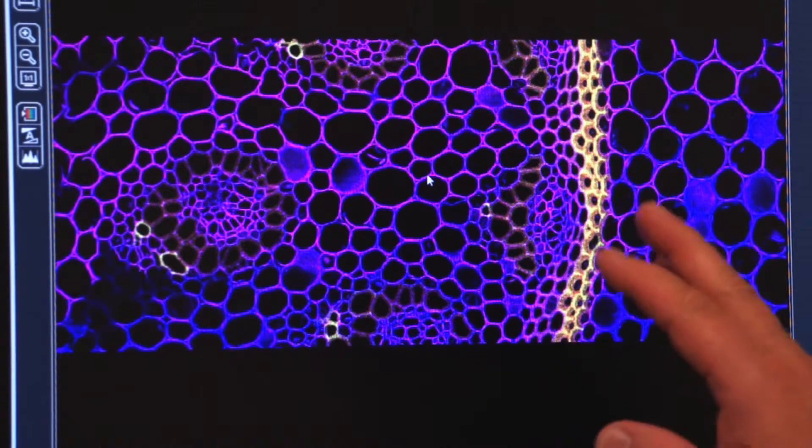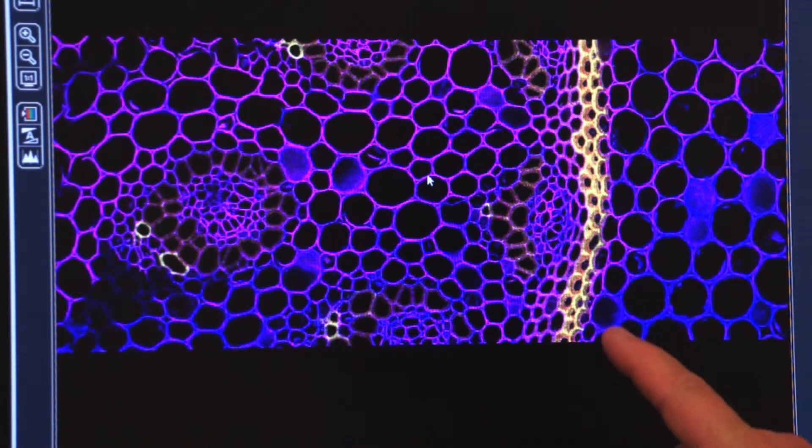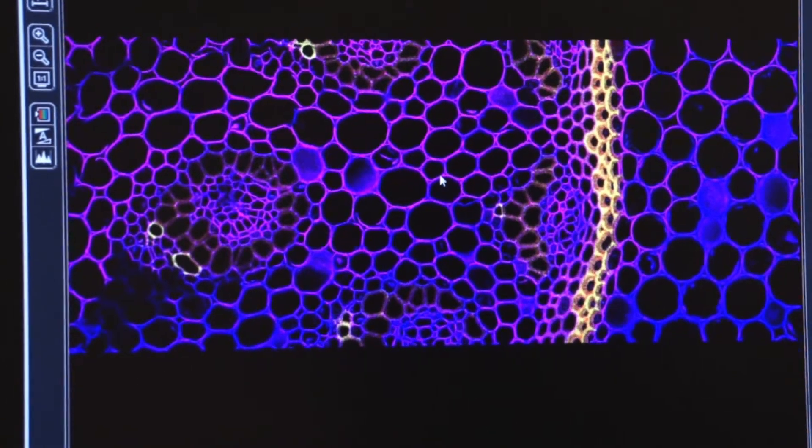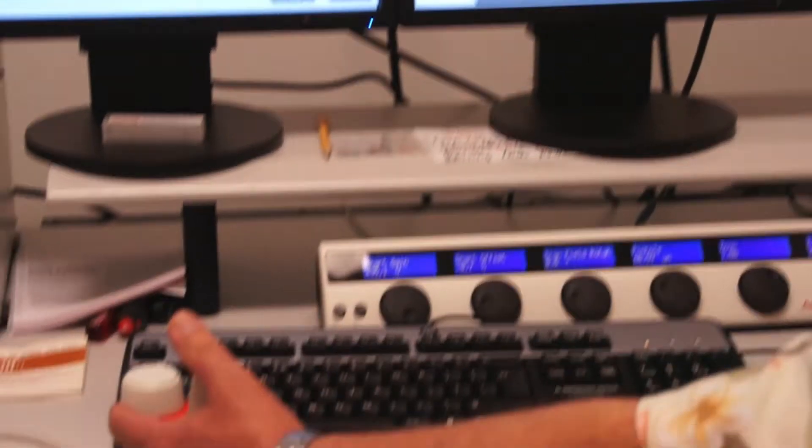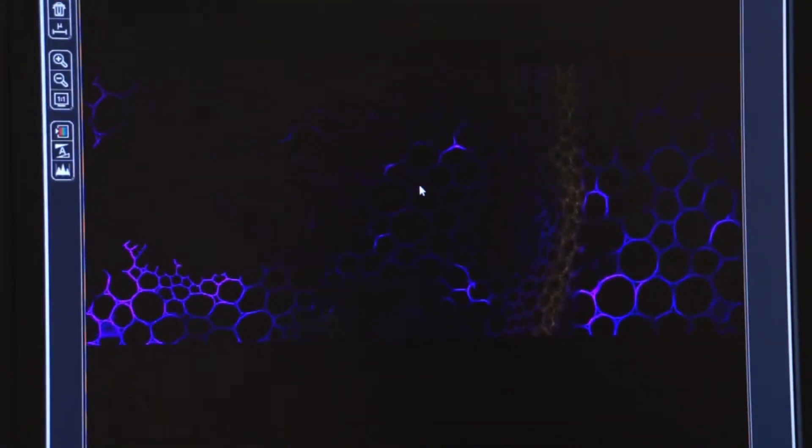Also, don't forget that your focus is very important. You could be under focused or over focused, and that will dramatically impact the quality of your image. As you can see, I'm focusing through back and forth, and you can see how the focus can actually eliminate the illumination altogether. So make sure that you're highly focused on your specimen.